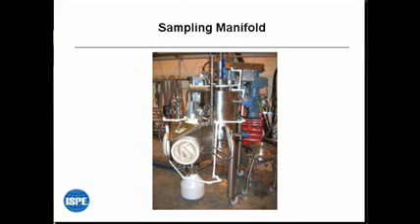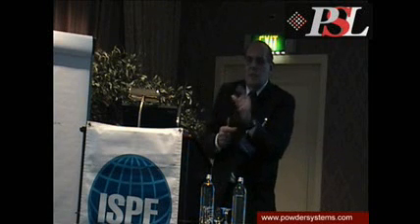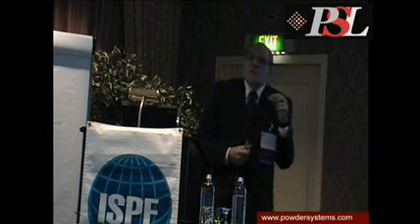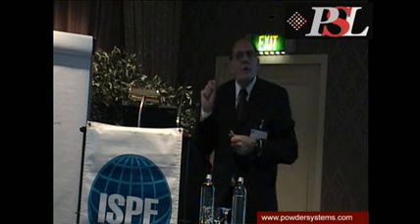We use a distributed manifold using regular plumbing pipe, PVC fittings, elbows, T's, to locate our samples in a rigid framework around the hardware. So here's a sample right here. There's one here. There's one here. That's a rubber stopper that contains a millipore cassette adapter, which has the standard number 2 taper that fits your cassette. And on the bottom of it is a critical orifice, 2 liters per minute critical orifice. We have to machine these with a Dremel to get them to be a nice finish and matched, because they're not very well matched when they come.